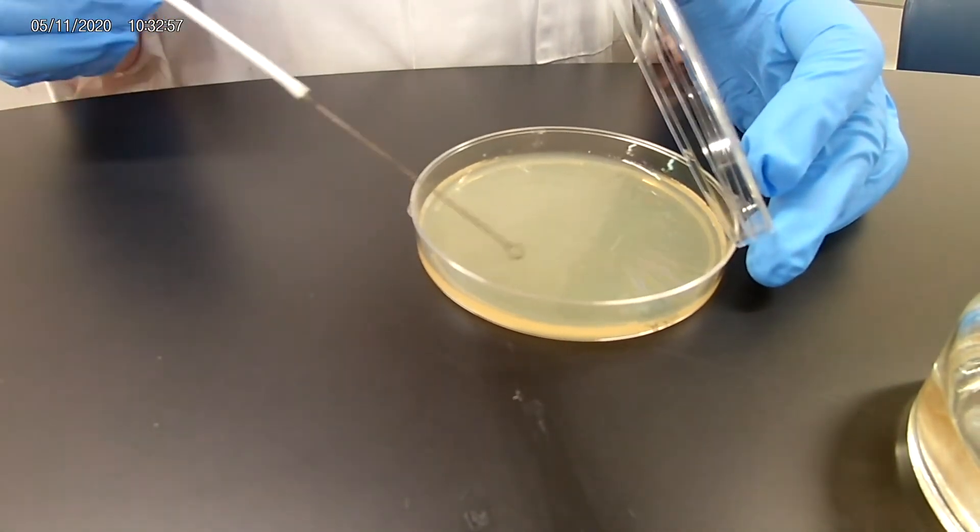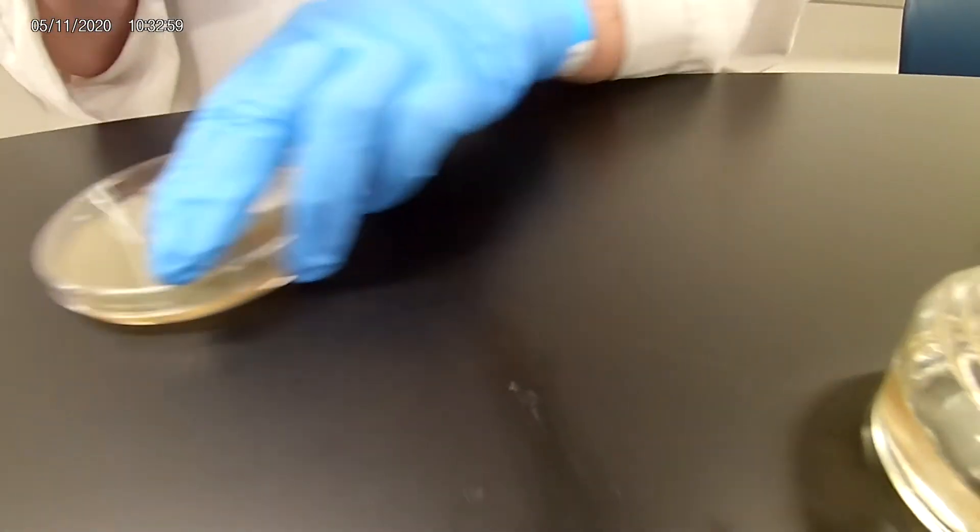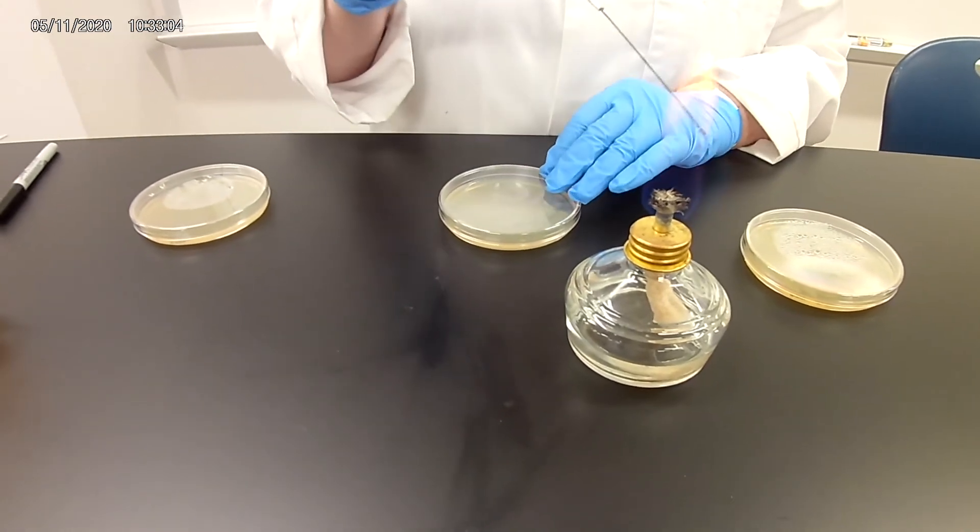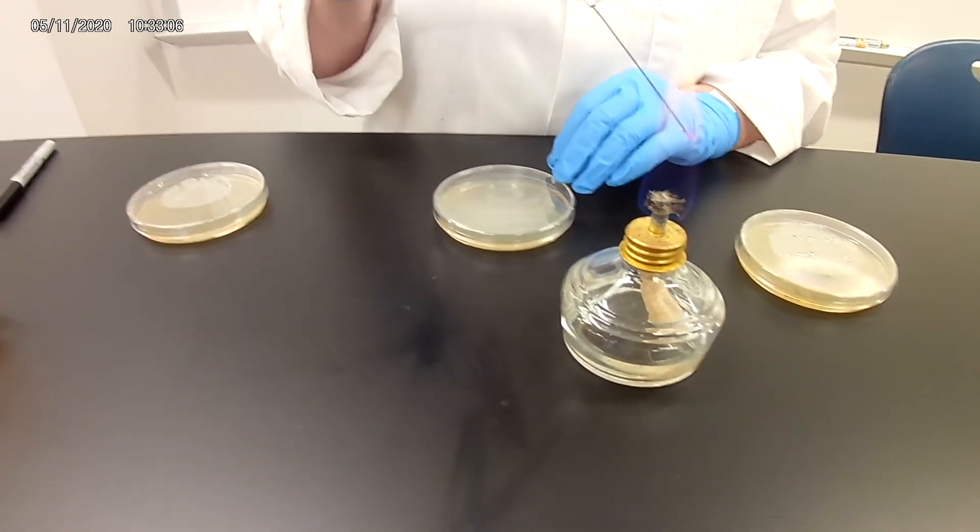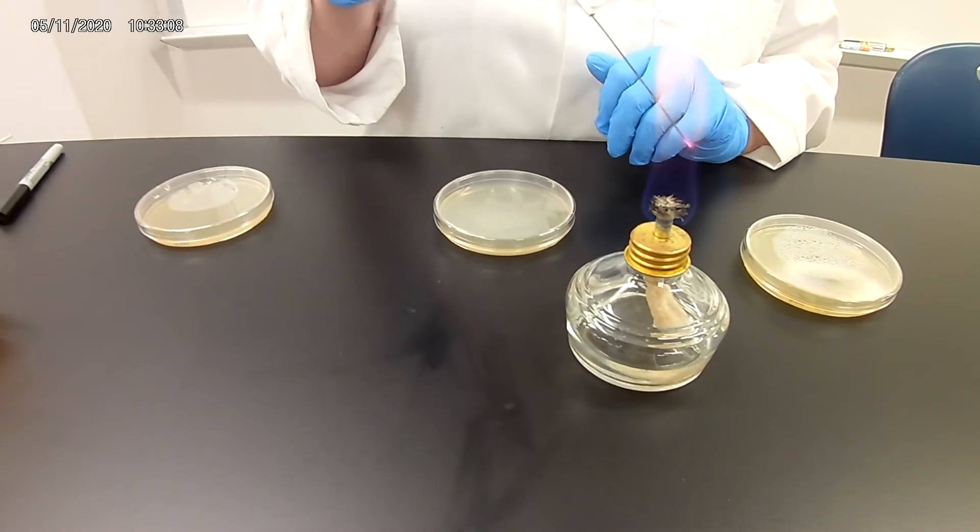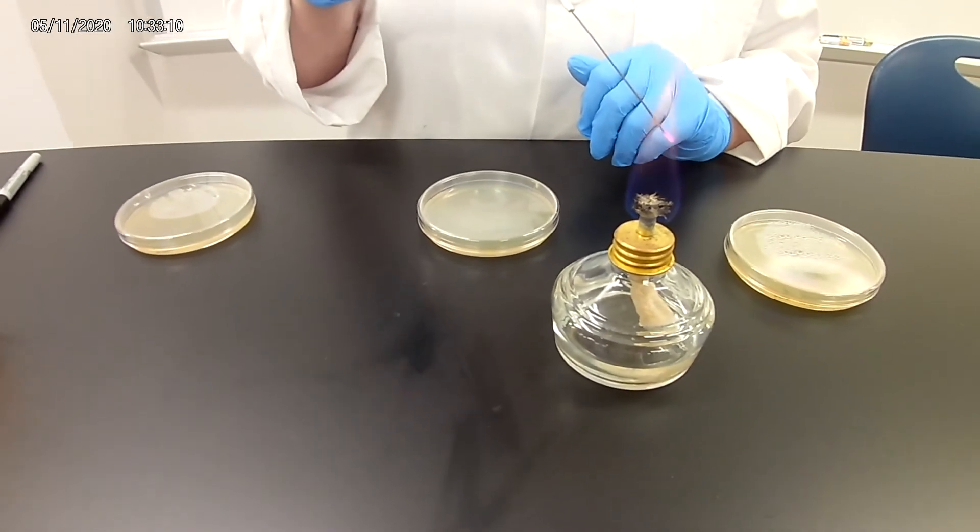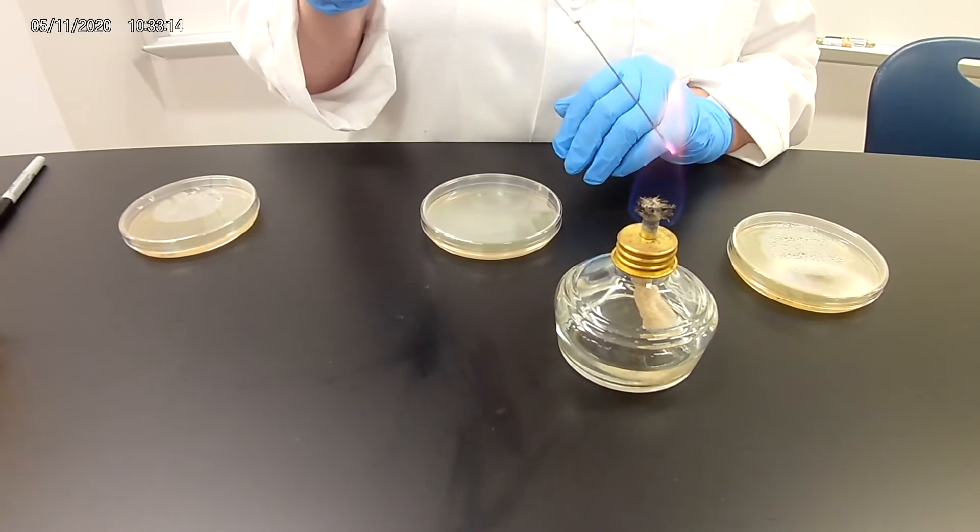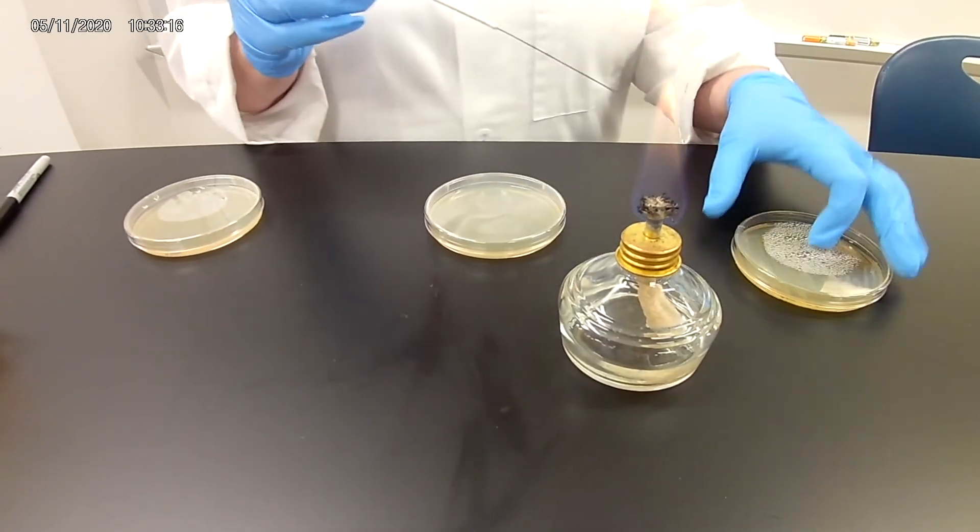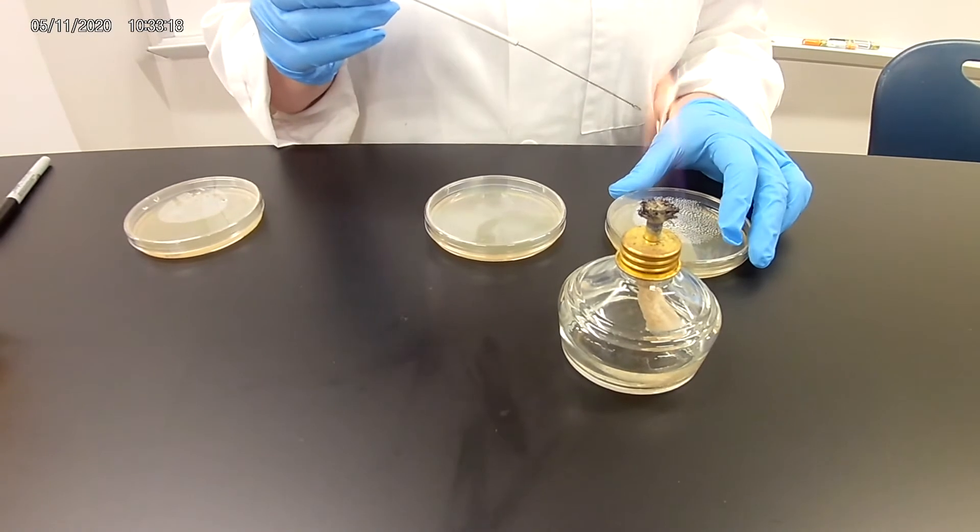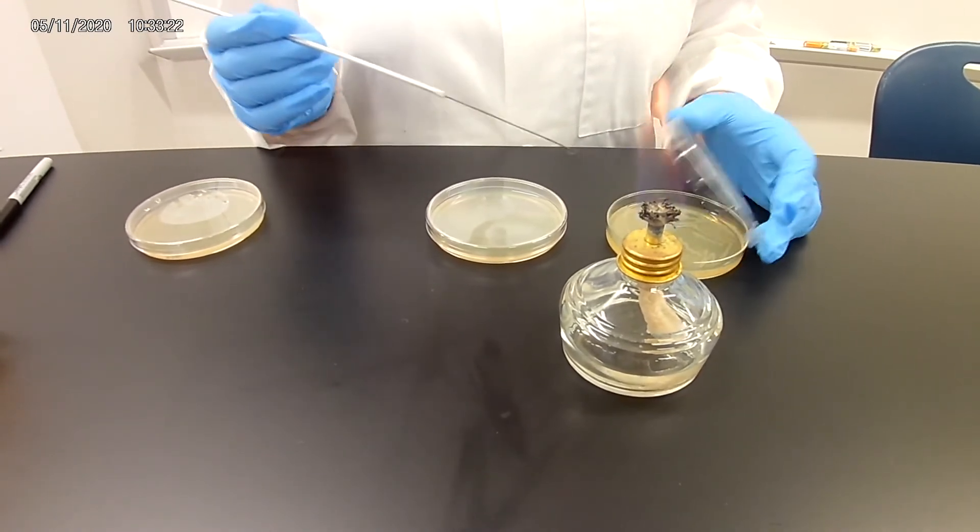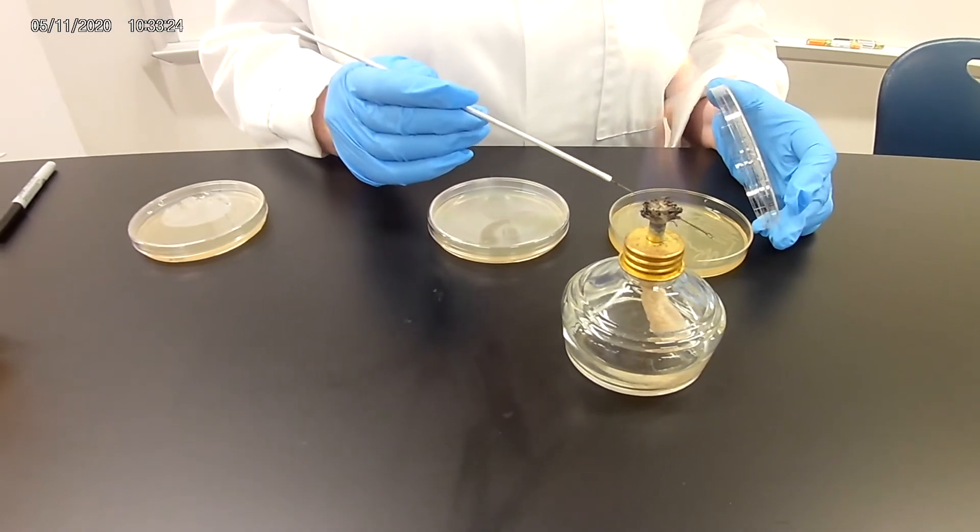So this will be our last area. That plate is now inoculated. The other method, which is the one I personally prefer doing, it's just the way I learned it, is very similar except instead of four quadrants, we're going to use three different areas, but with the same concept. We start with our initial area of going from our original stock plate.